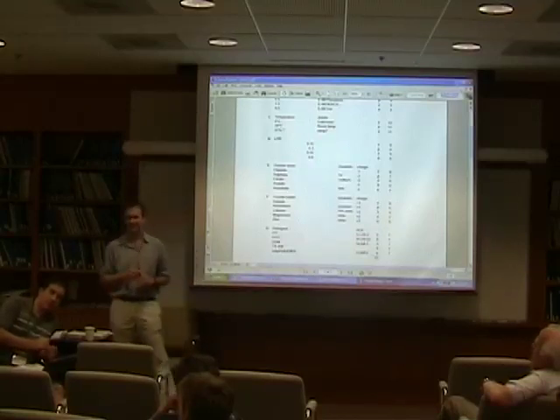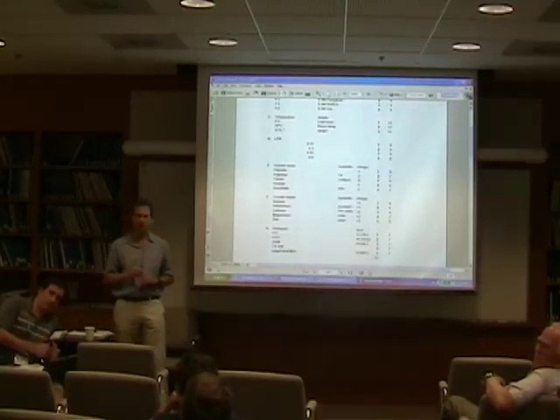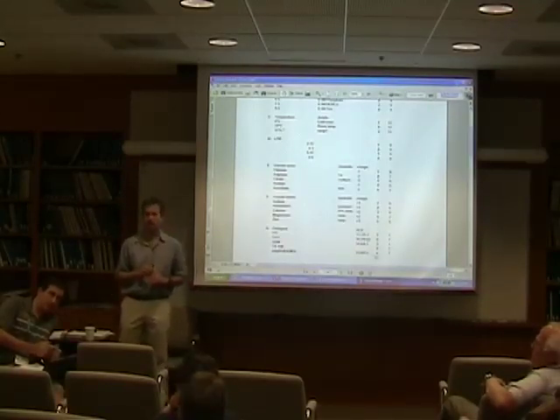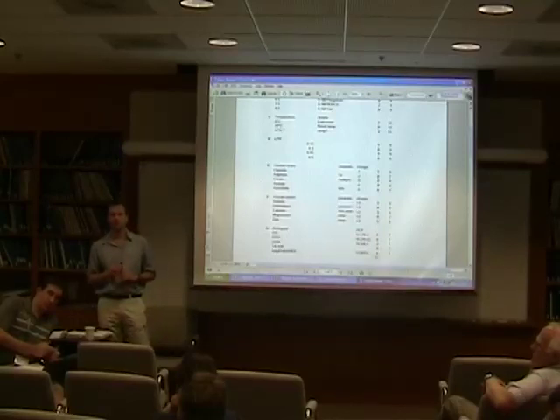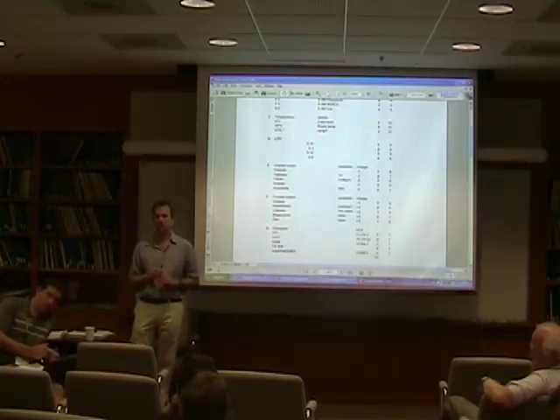So also, do you have a lysozyme standard? Is there something that you could plug into these, maybe a few of them? Because what you need is to test. So you take 3 different membrane proteins from different classes, a beta barrel, different alpha helices, and you just throw them into this matrix, as a start anyway. That's right. I think that's a very good idea. And see whether we find even there a space or something.